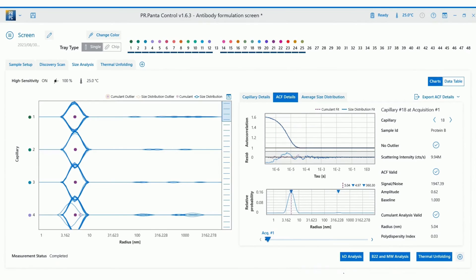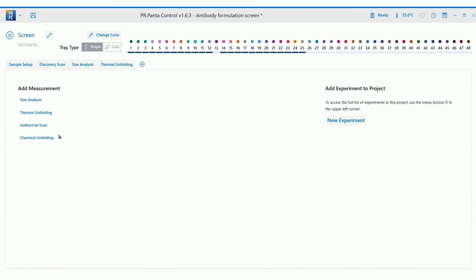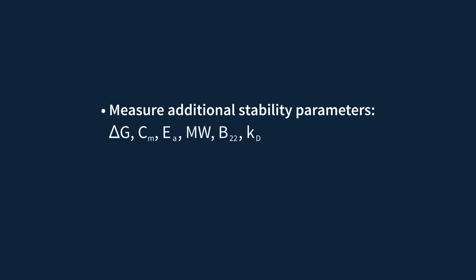With some additional experimental setup, Prometheus Panta also allows you to measure self-association parameters, molecular weight, or do chemical denaturation experiments. And it is possible to gain even more insight into more stability characteristics of your proteins of interest.